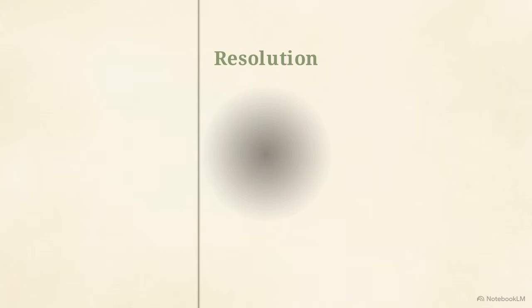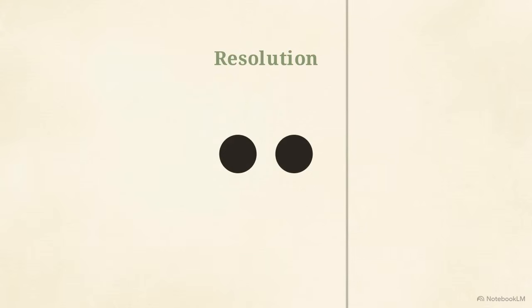Our biology imposes a physical limit. Under 0.1 millimeters, the eye cannot separate two objects. They blur together. Magnifying that dot only creates a larger blur. Increasing resolution distinguishes detail, snapping the image into focus to reveal two distinct dots.